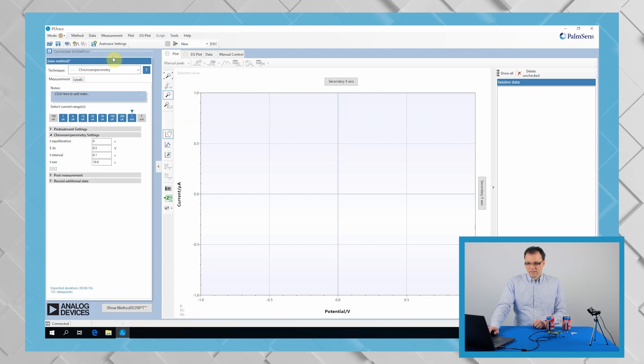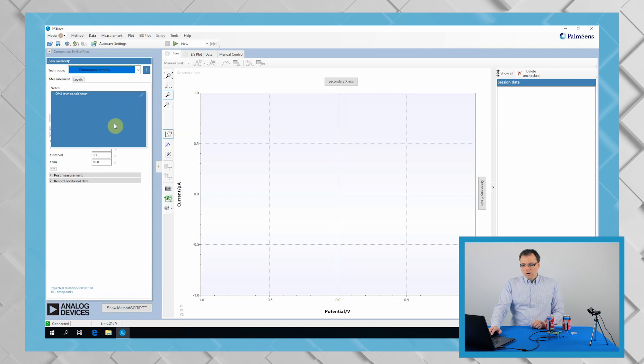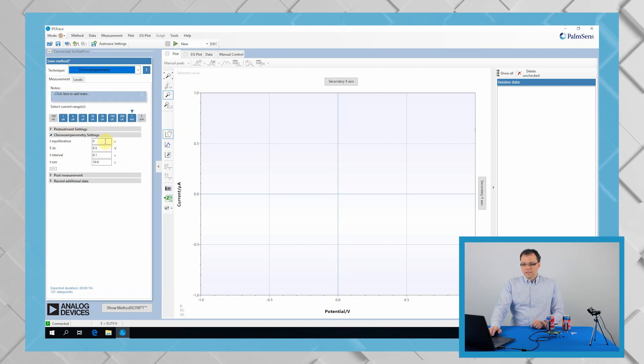First, we're going to make sure that the Amstead Pico appears in the drop-down menu for the connection and then we press the connect button. Once it's connected, we make sure we have chosen the right technique, which is chronoamperimetry. As the name suggests, it means record current over time while applying a constant potential. We have chosen most of the available current ranges. For the auto-ranging of the Amstead Pico to take place, we should give it some time in advance, so we put an equilibration time of 5 seconds. The suggested potential by Zimmer and Peacock to use these electrodes is 0.65 volts or 650 millivolts. We're going to record a value every half second and let this measurement run for 600 seconds.